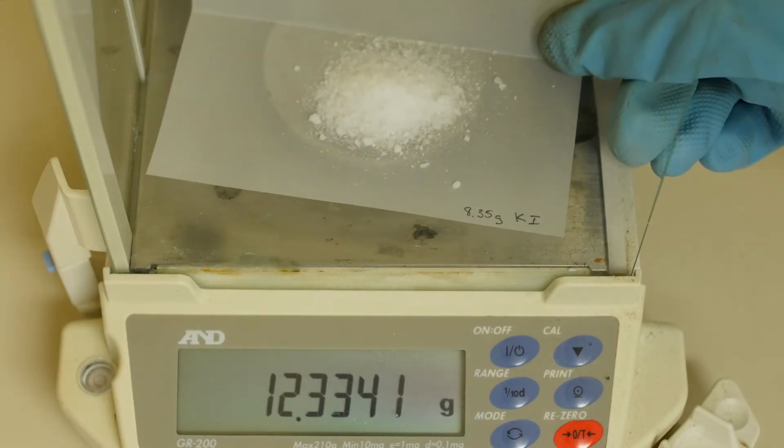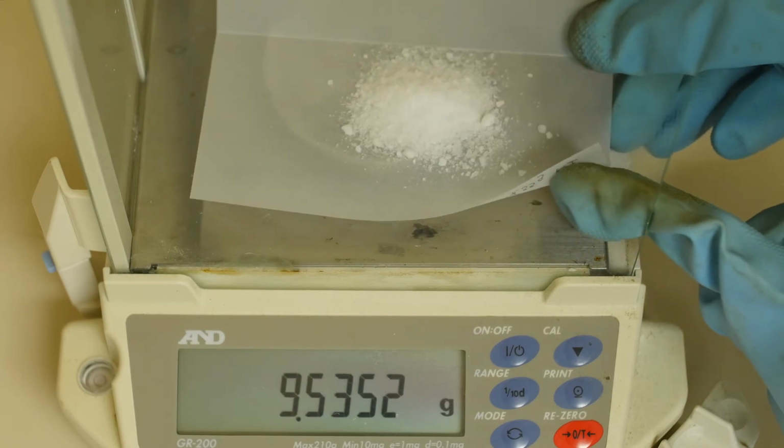Any excess must be discarded and should never go back into the original reagent container to maintain its purity.